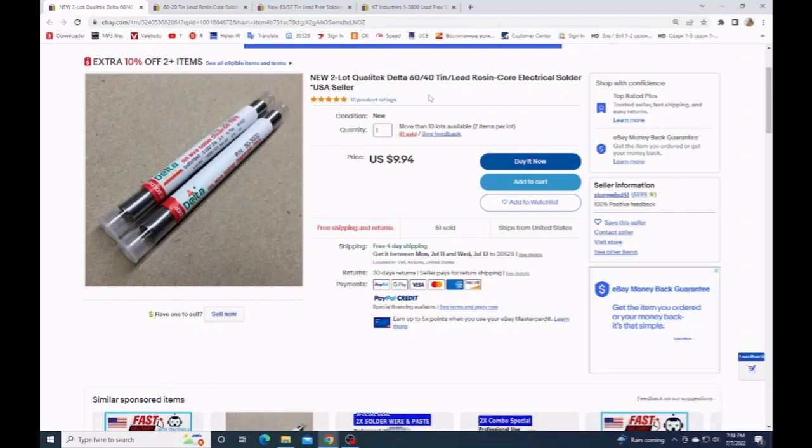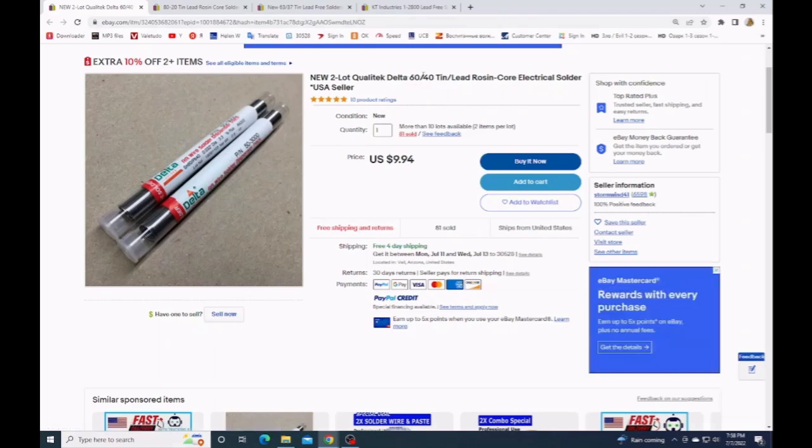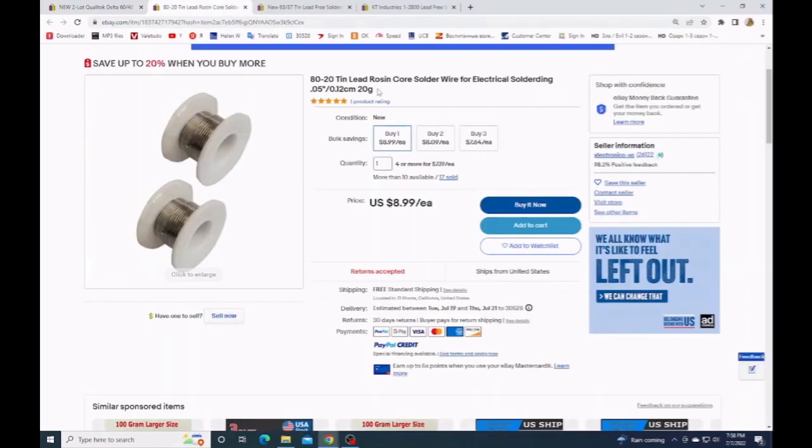It's very important to find tin that is lead-free. For example, 60% tin, 40% lead — that is bad. And 80% tin, 20% lead — that is bad too.